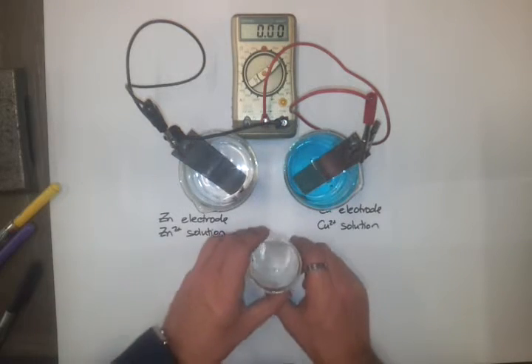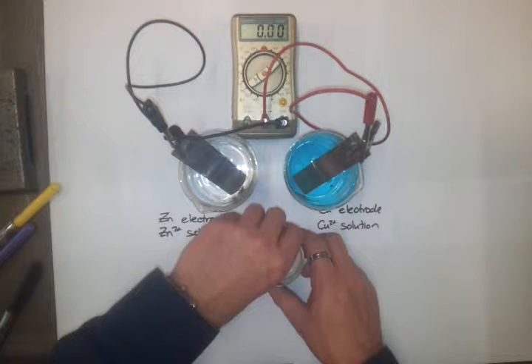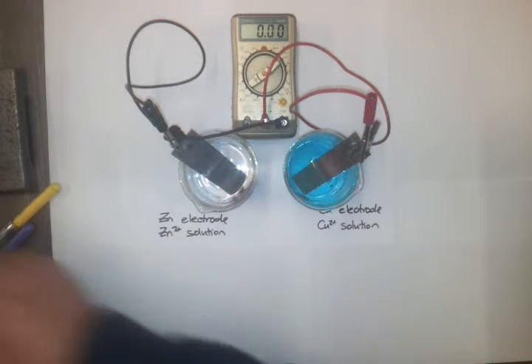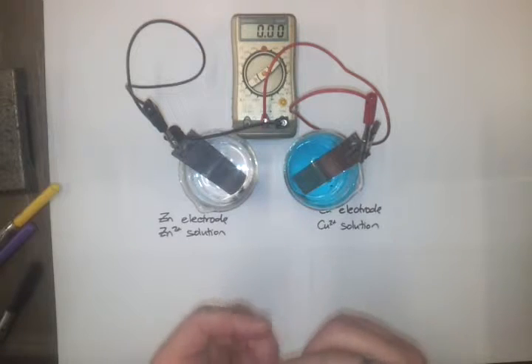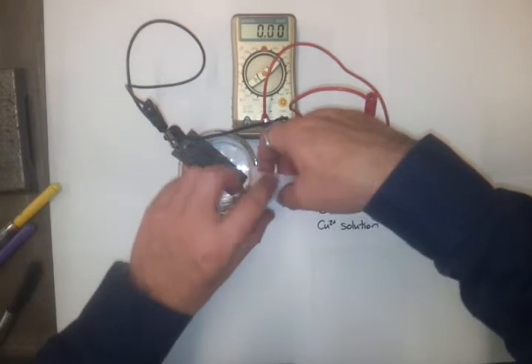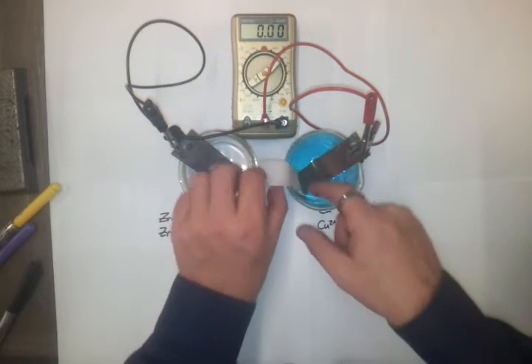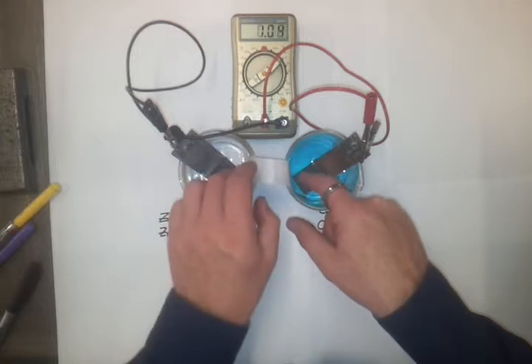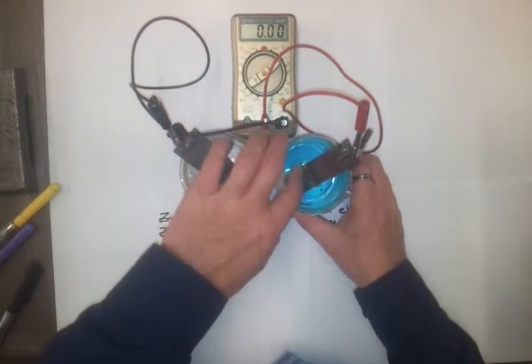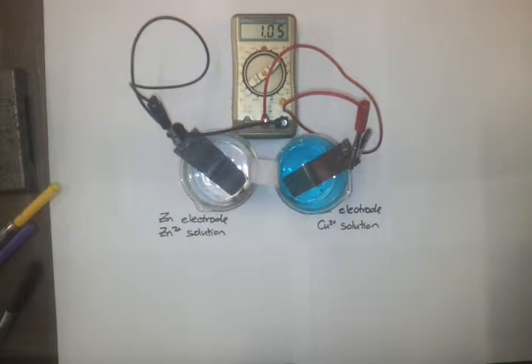So what I've got in this beaker here is a solution of potassium nitrate and a piece of filter paper. I'm using the filter paper because it's very porous, using the potassium nitrate because potassium ions and nitrate ions are very motile, so they can move. This will help complete the circuit or connect the half cells. As soon as I put this in, I should see, hopefully, a voltage on my multimeter. Just going to make sure that both parts are connecting, and then we can see 1.05 volts.